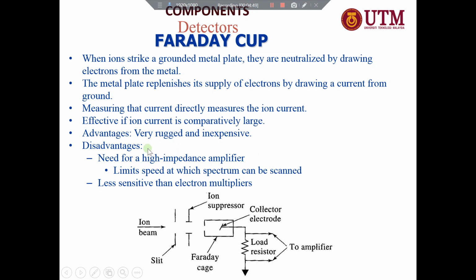Okay, compared to the electron multipliers, the Faraday cup is much less sensitive, because we are not really multiplying the number of electrons given off. We are not really calculating or producing a multiplication of the number of electrons extracted. Alright. Okay, that's all about the Faraday cup.